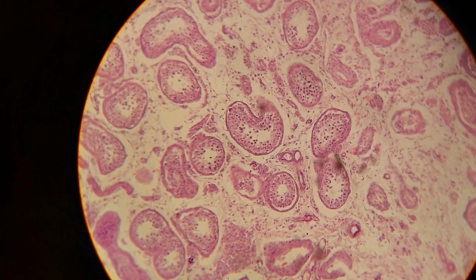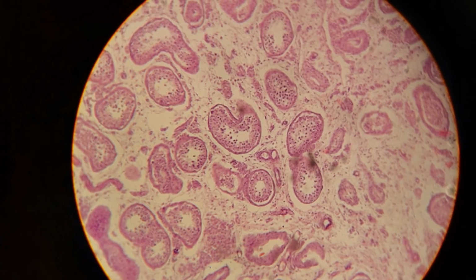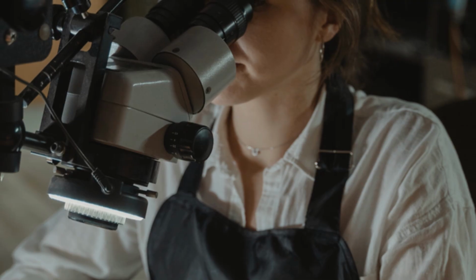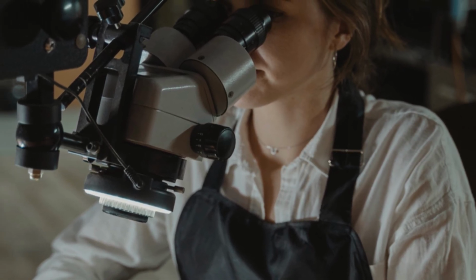In stark contrast, electron microscope images are black and white. Because the microscope detects electrons, not light, the image maps electrons that pass through the sample in a TEM, or that were scattered from the surface in an SEM. Darker areas mean more electrons blocked, denser structures. Lighter areas mean more electrons detected. Scientists often add color later with software. That's false coloring, but the raw data is grayscale.